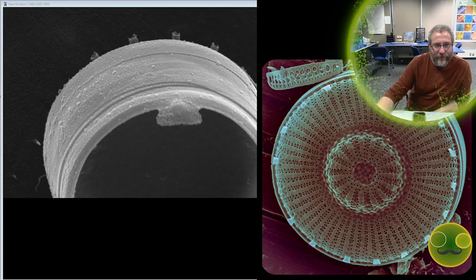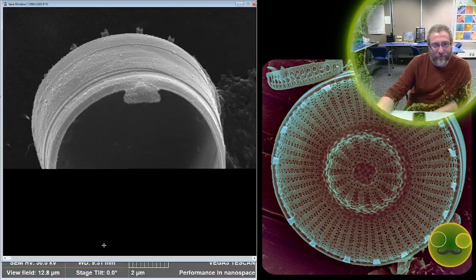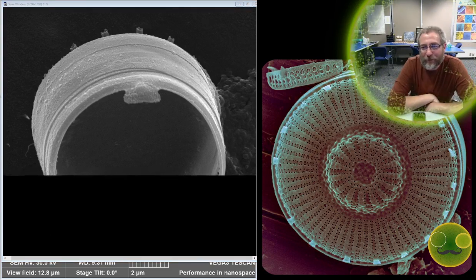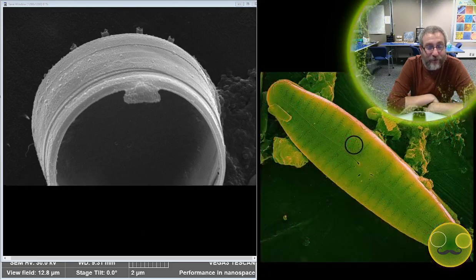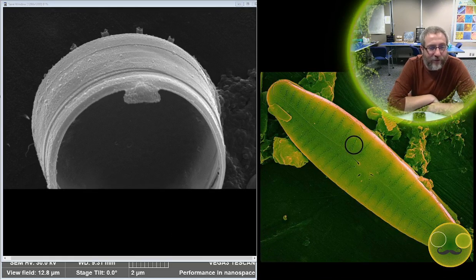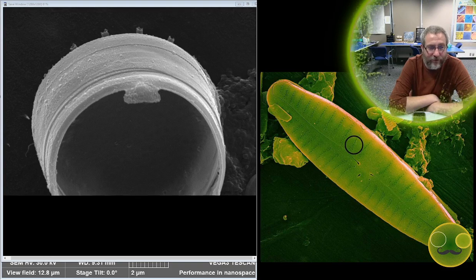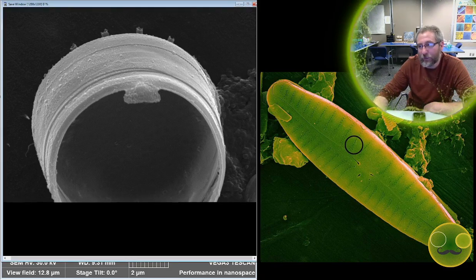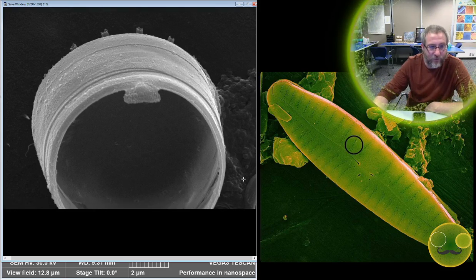I'm glad that it's at least stimulating your brain a little bit, Pink. You know, it's a science stream, so we're always aiming to try to capture people's interest and showcasing the power of the scanning electron microscope, because this particular sample that we're looking at is being viewed at 27,000 times. So that's the other issue.